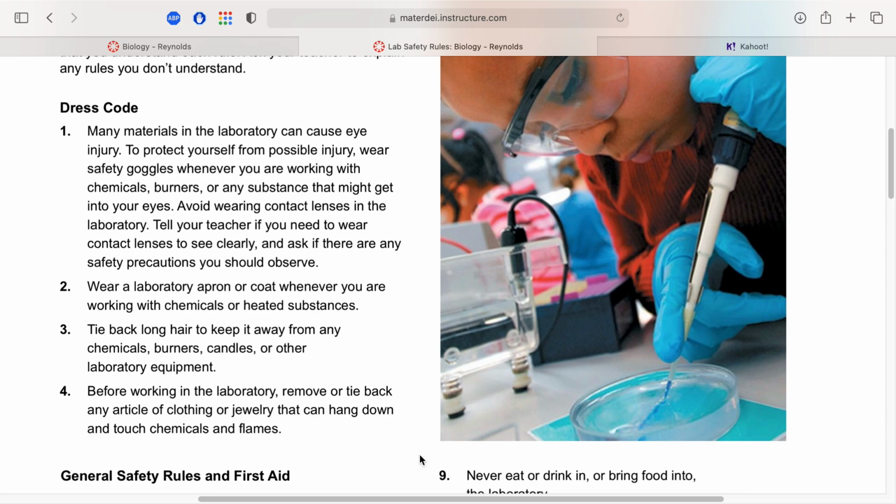It's used really to load up gels for DNA analysis. So it's a one-time use tip, and then they would throw it away. You would never touch your pipette to the surface of something. You're going to contaminate the pipette tip and the object you're dealing with. If you're asked to drop water from a pipette, make sure it goes through the air. Don't let it rest on anything.